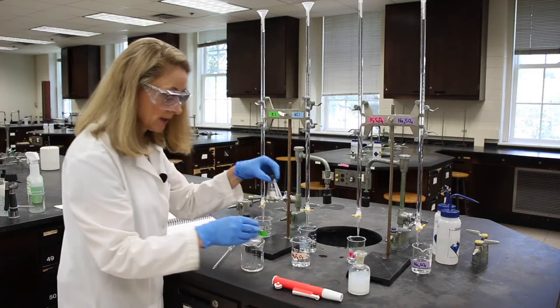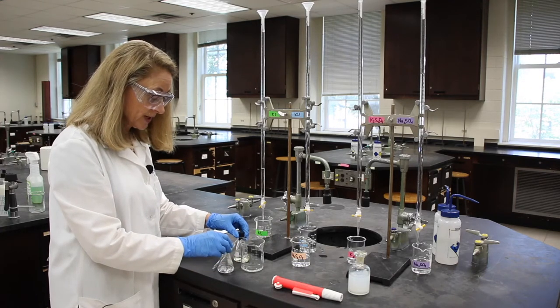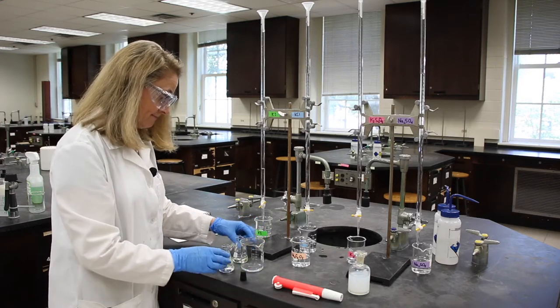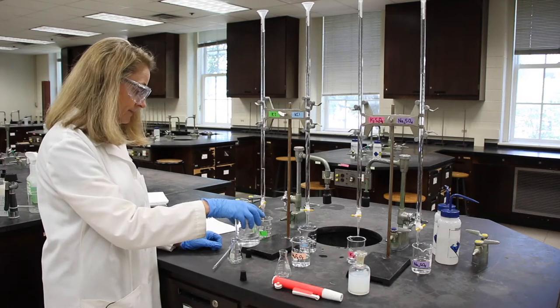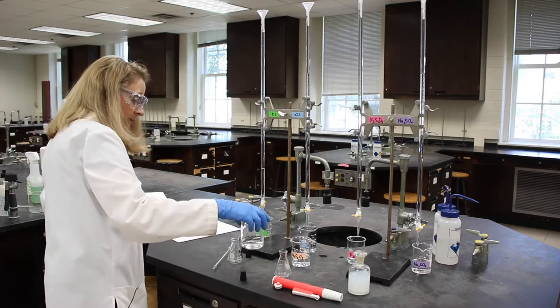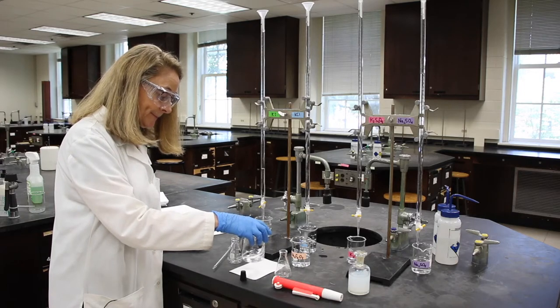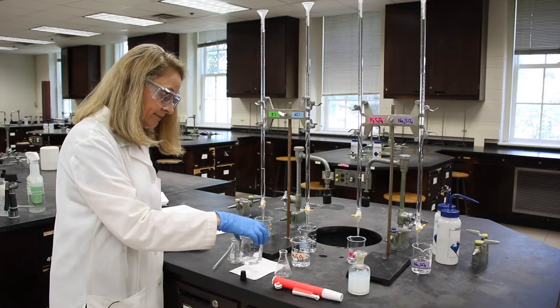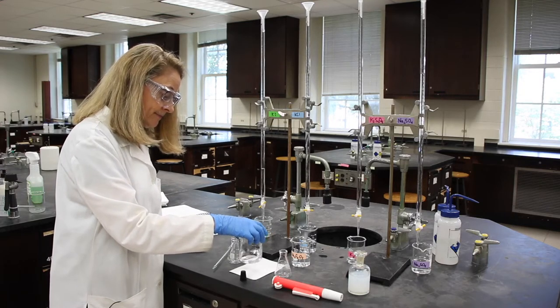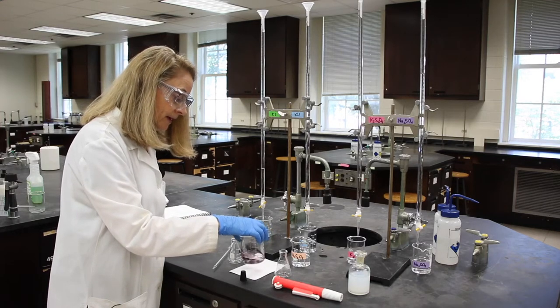And the next thing I'll do is I'll pour these in at the same time, and we'll measure the time to a color. All right, are you ready with your timer? Again, sometimes it's helpful to put a piece of white paper underneath to see the color change. And there's a color change right there.